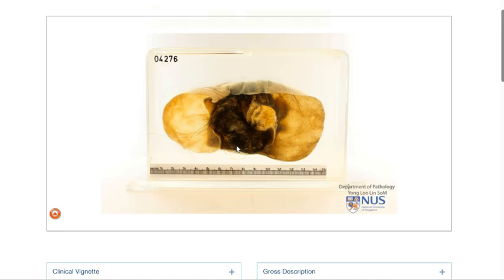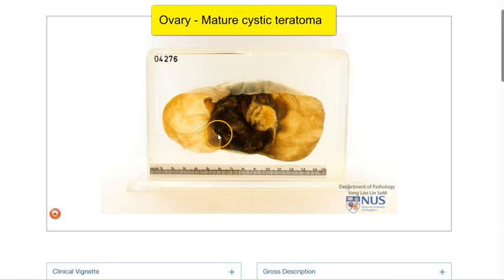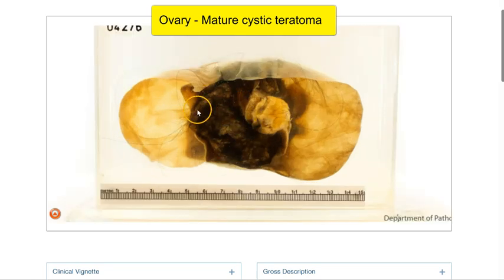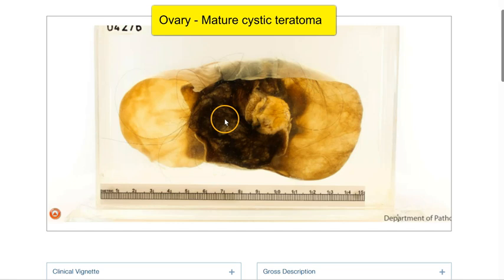This is a virtual pathology specimen of a mature cystic teratoma of the ovary. We're looking at the cut surface where we can see three cyst locules.